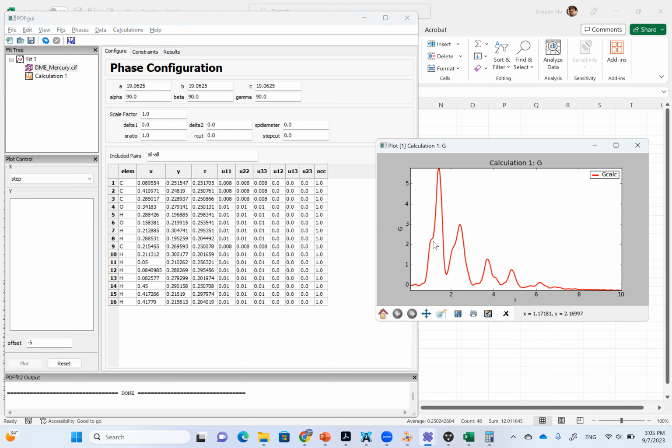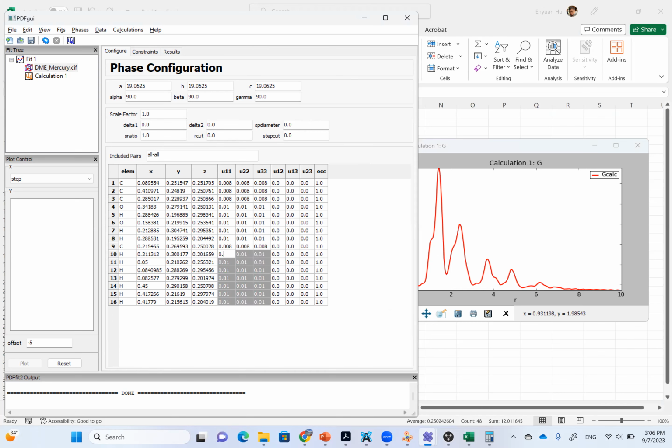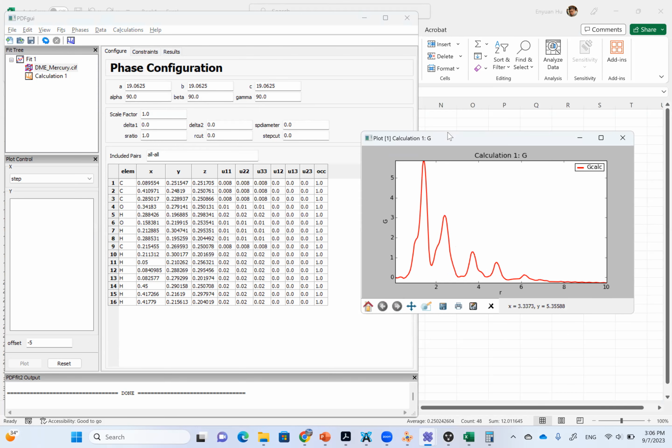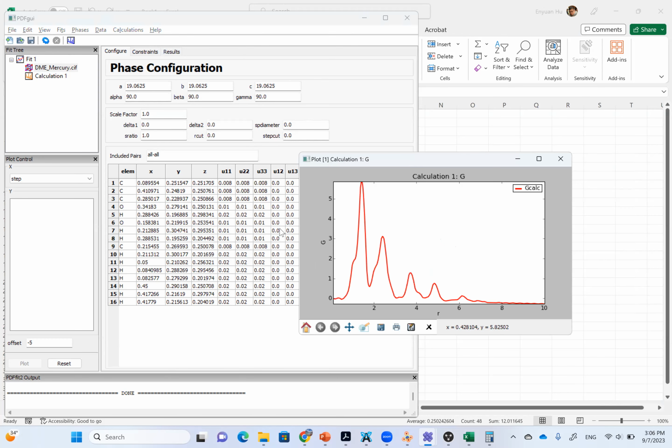And also we can manipulate this peak. If we realize in the pattern this peak is very low, then maybe we increase the ADP for hydrogen. Then the hydrogen is so weak, so small, so it should not have any real change. That's a little bit different, small changes. So yeah, there are several other things that we can play around with about the detail, shape, and intensity of those peaks. But that's in general how we do the PDF calculation for small molecules, right?